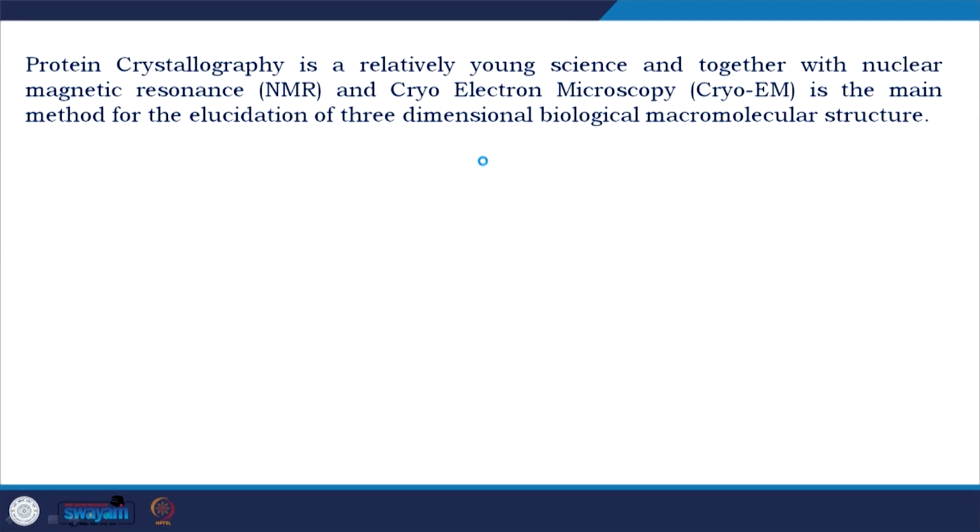We will talk in details protein crystallography. It is a relatively young science, and together with nuclear magnetic resonance NMR and cryo-electron microscopy or cryo-EM, it is the main method for the elucidation of three-dimensional biological macromolecular structure like protein, like DNA protein complex, like virus.